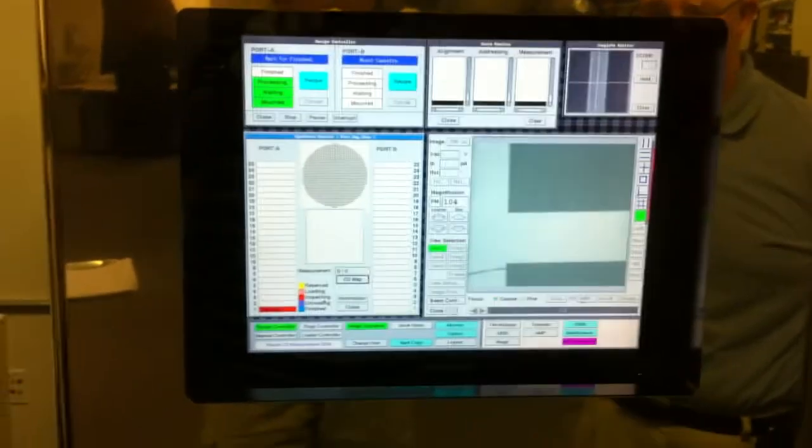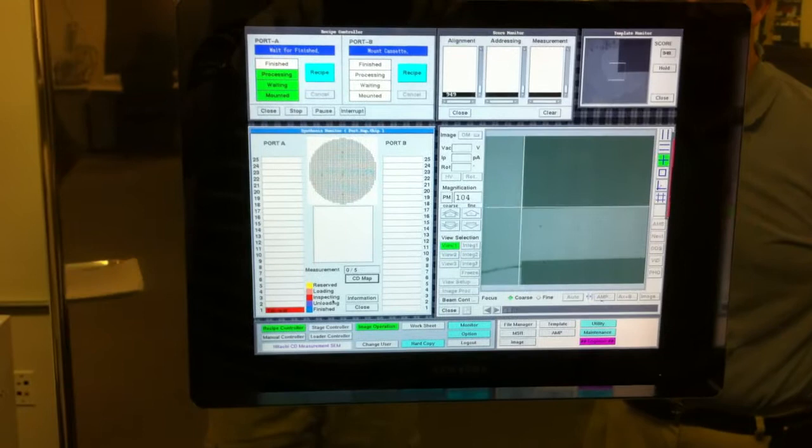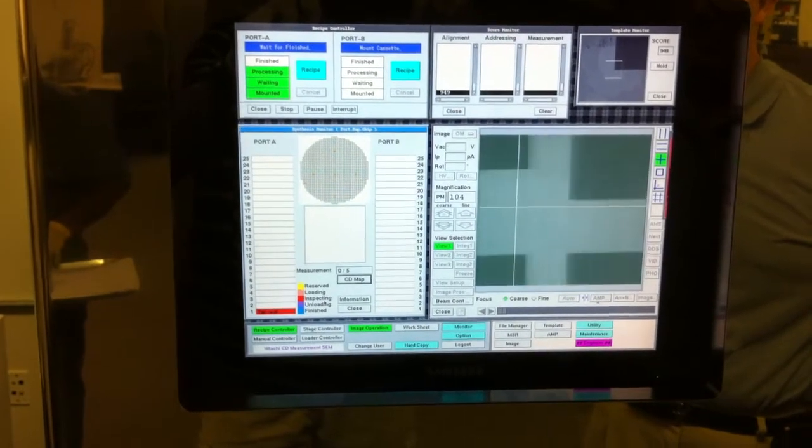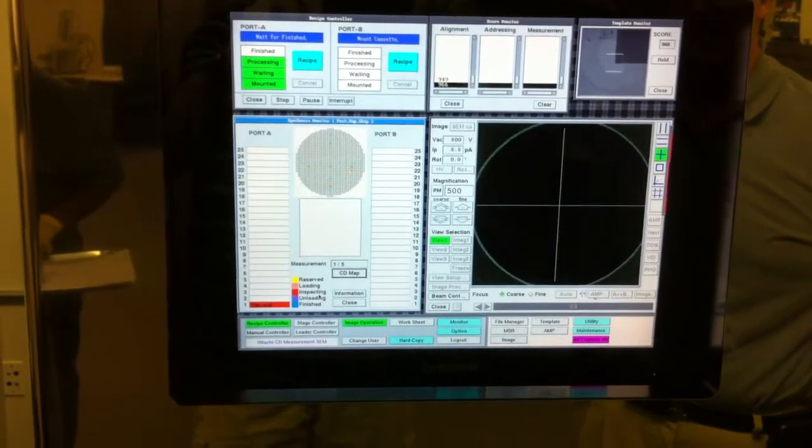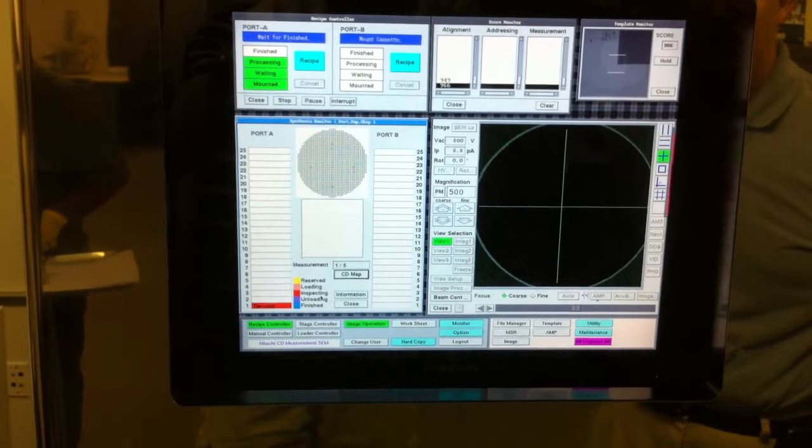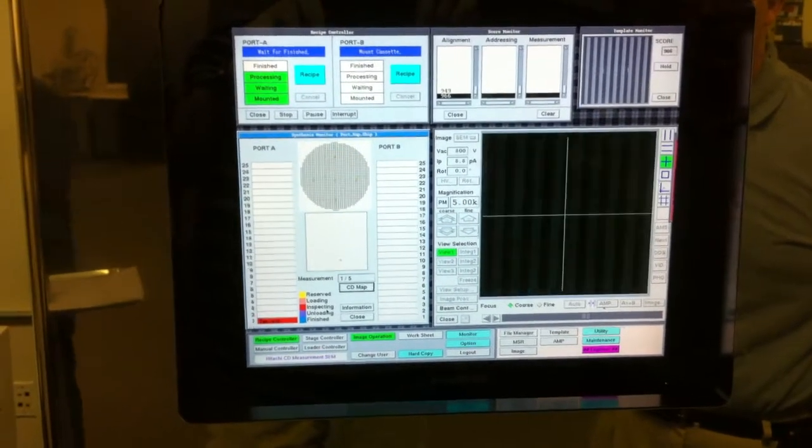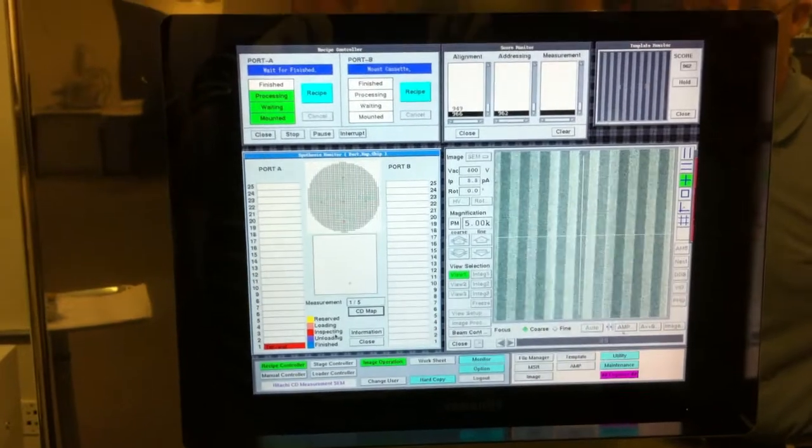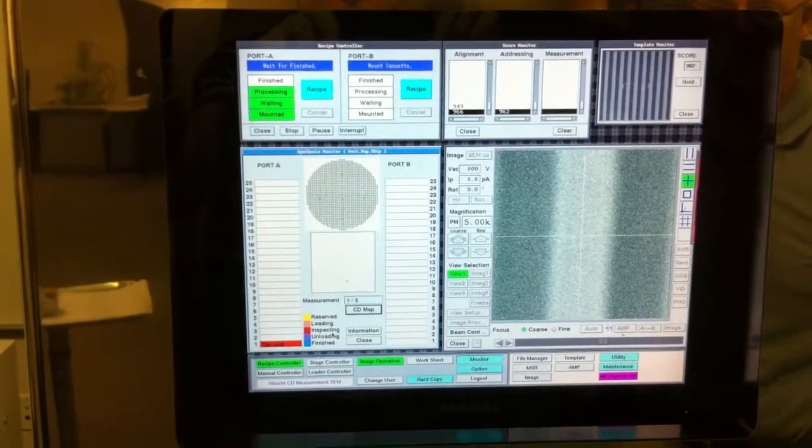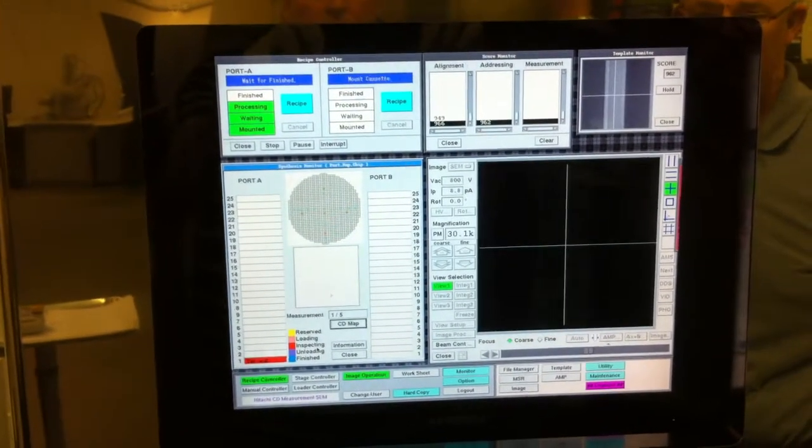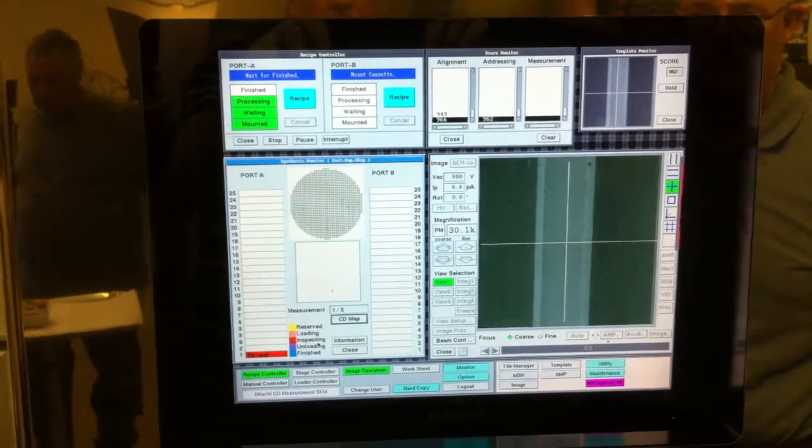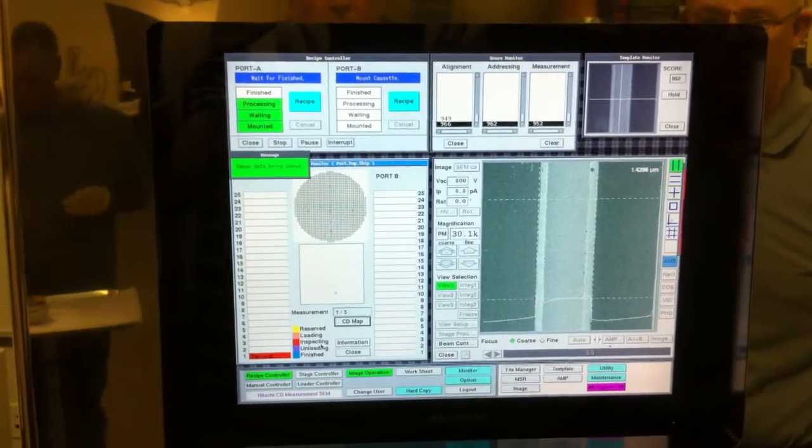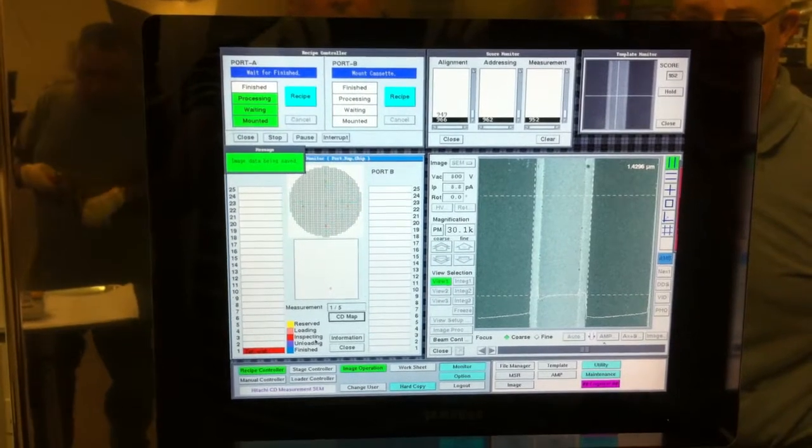It goes to the first alignment site and the second alignment site. It goes up to the first site for measurement, takes the center line, does a quick autofocus. Very nice resolution there, and takes the measurement.